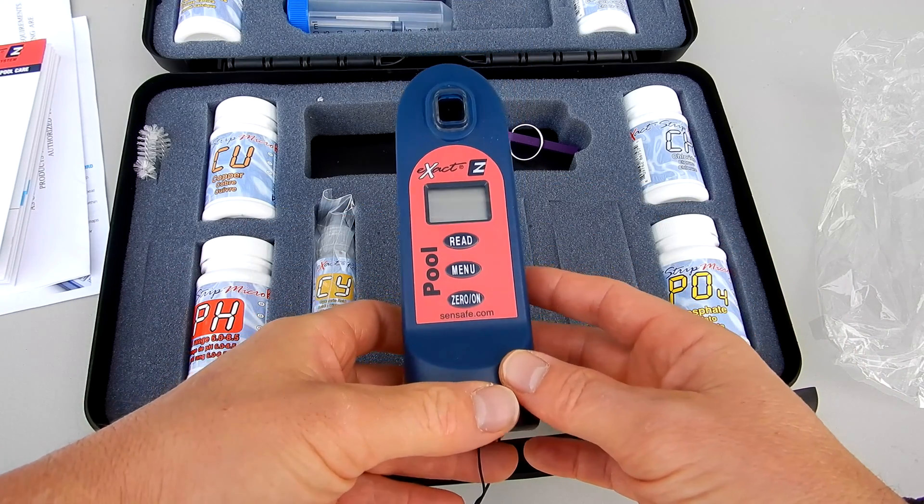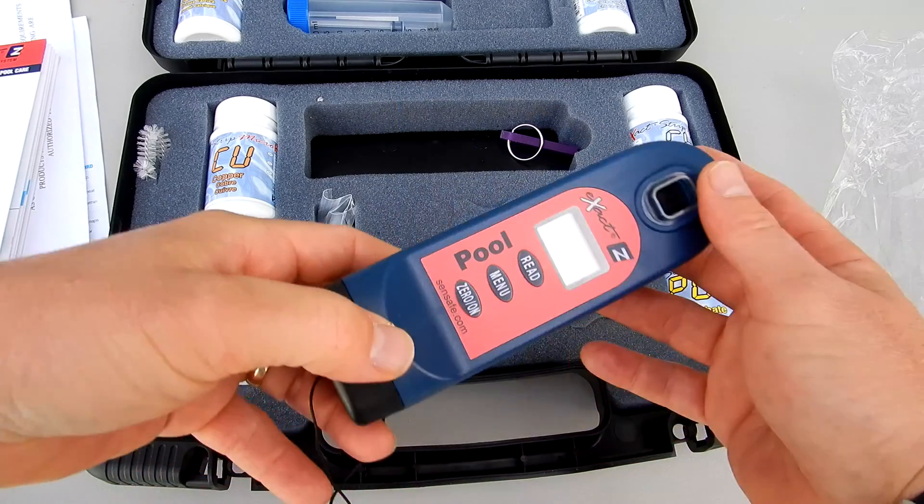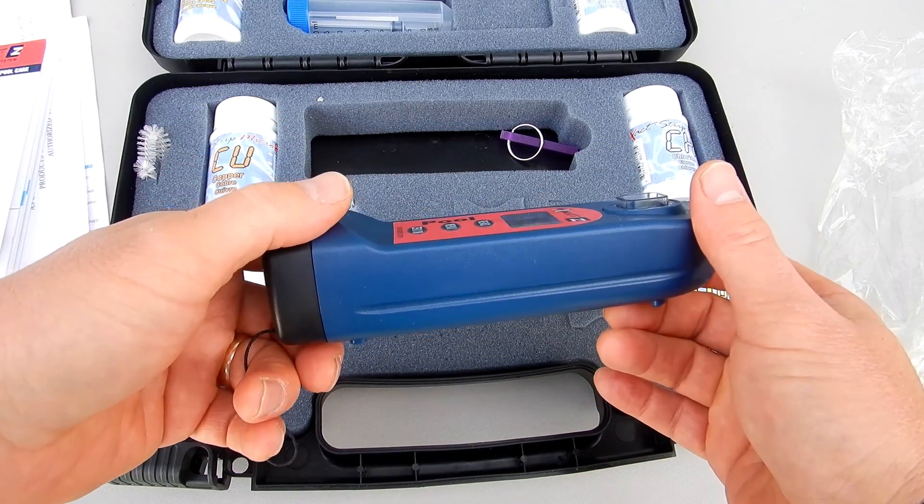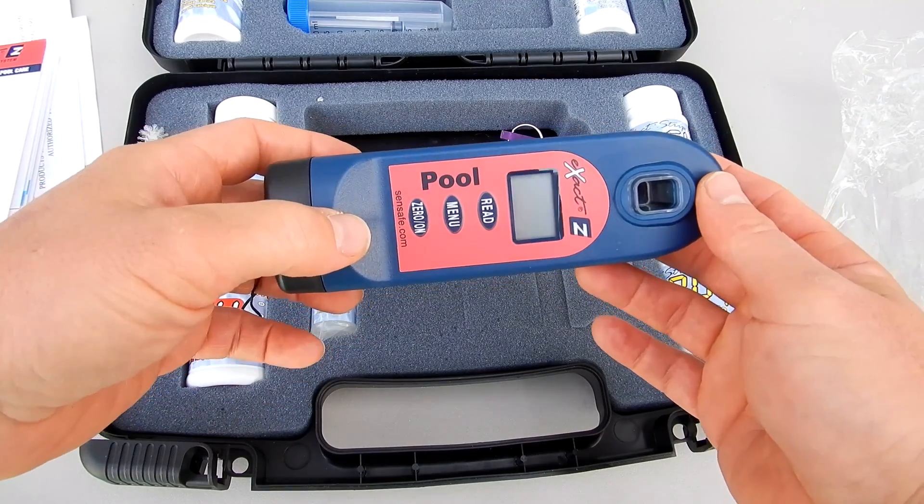Then you have the POOL EXACT EZ Photometer. This photometer is made in the United States. It's also 100% waterproof and it comes with a 2-year manufacturer warranty.